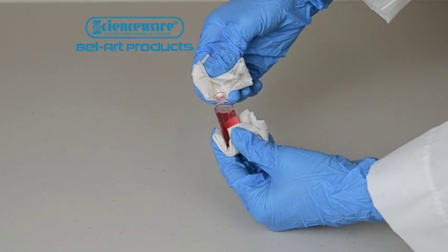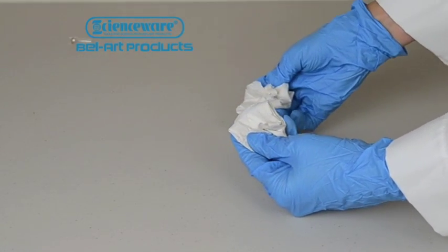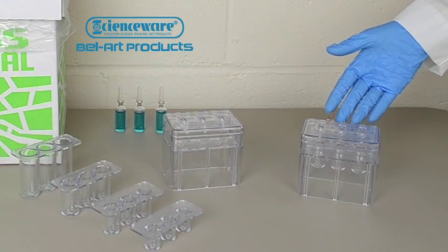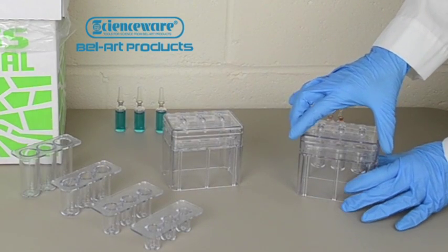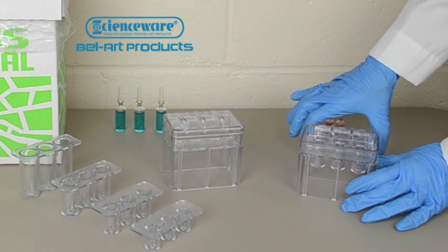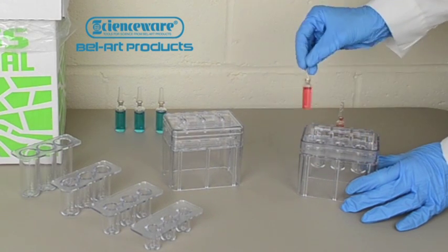Do you find it difficult to open ampules? Have you cut yourself or spilled ampule contents because they're just too hard to break? The BreakSafe Ampule Opener by Bellart Products makes opening ampules easy and safe.